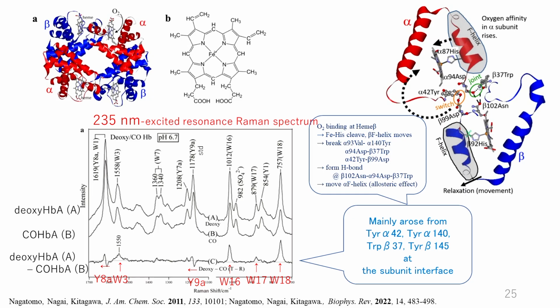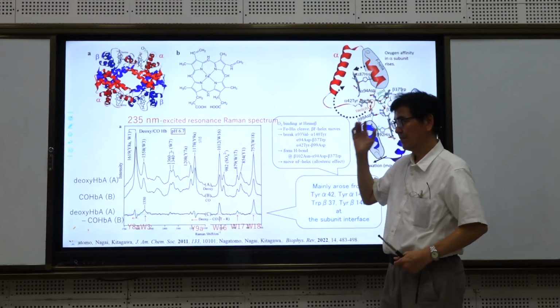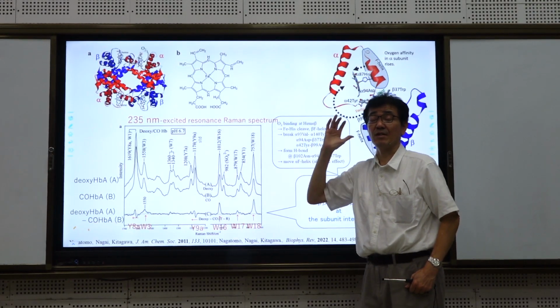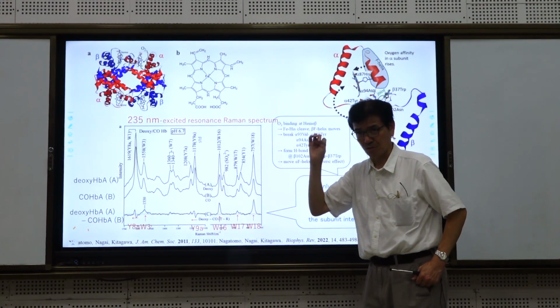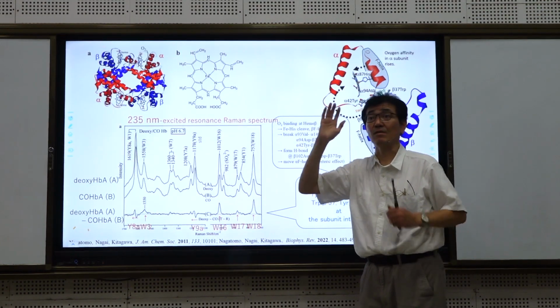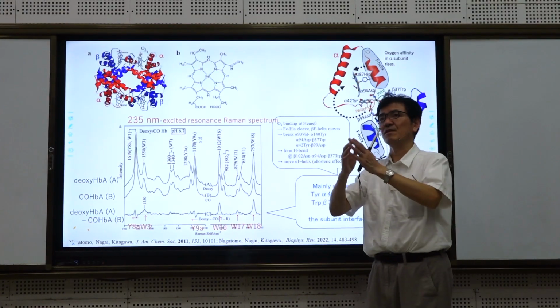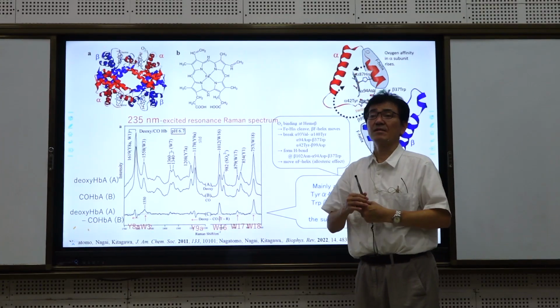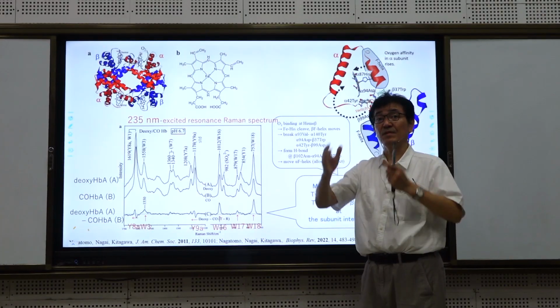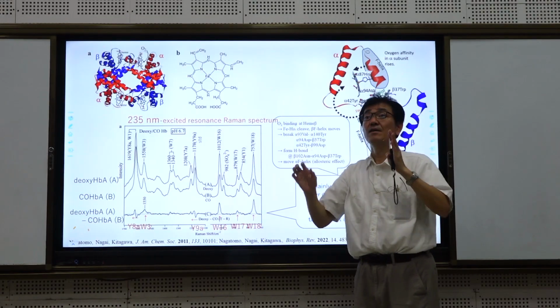When you want to analyze a molecule or biomolecule, please recall that the resonance Raman effect is useful, mutation is useful, and some marker bands are useful to get information about particular features. I want to know this part is in the literature. Then someone should study the relationship between structure and peak position, intensity, or band width.